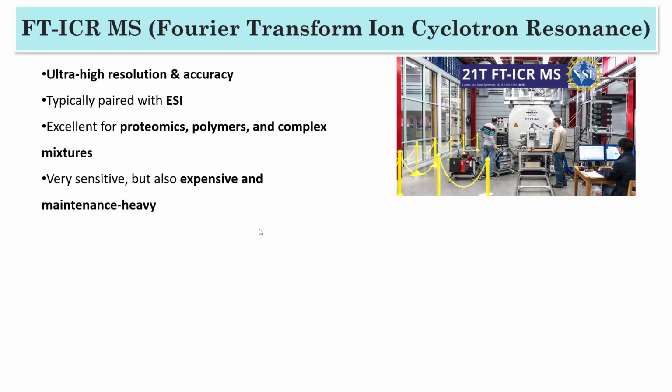Okay, so I think most of you must have seen NMR, right? The NMR instrument is very big, and also very expensive. But look at this FTICR MS. Before seeing this FTICR, I never imagined that mass spectrometry could be this big, because mass spectrometry is like a benchtop, very small size, like HRMS, FABMS, MALDI-TOF, it is not so big.